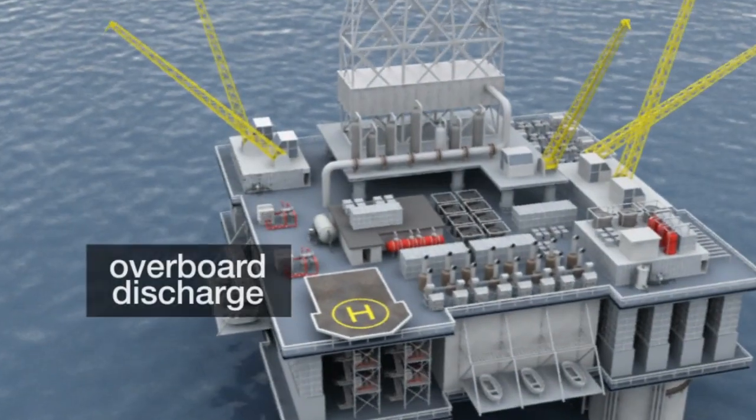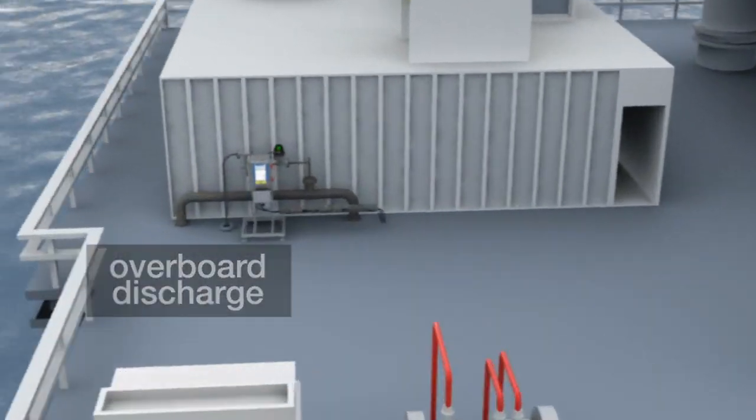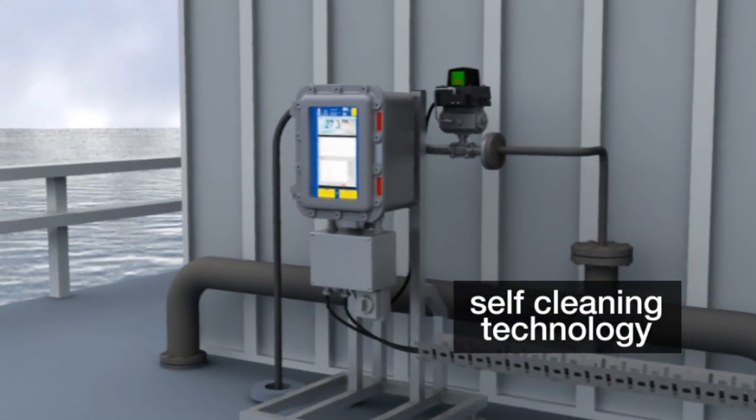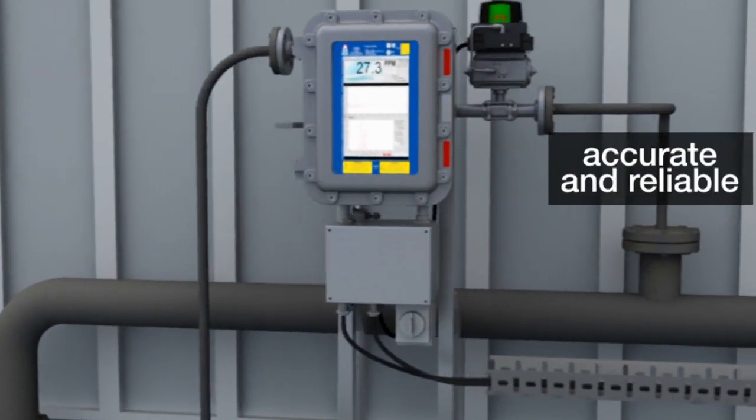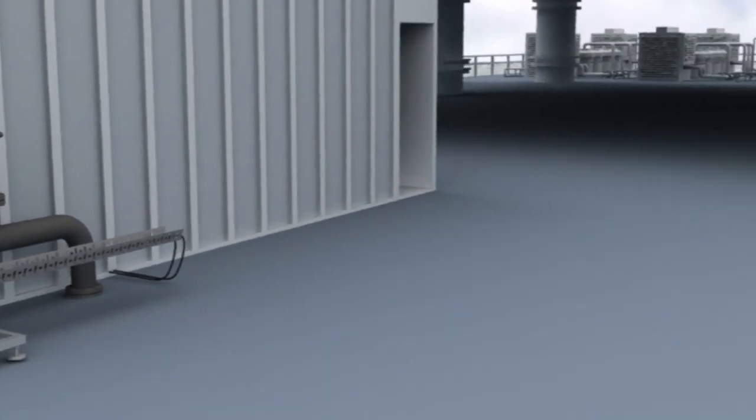There have always been issues with overboard discharge measurement, but our patented self-cleaning technology ensures that the measurements we report are accurate and reliable.